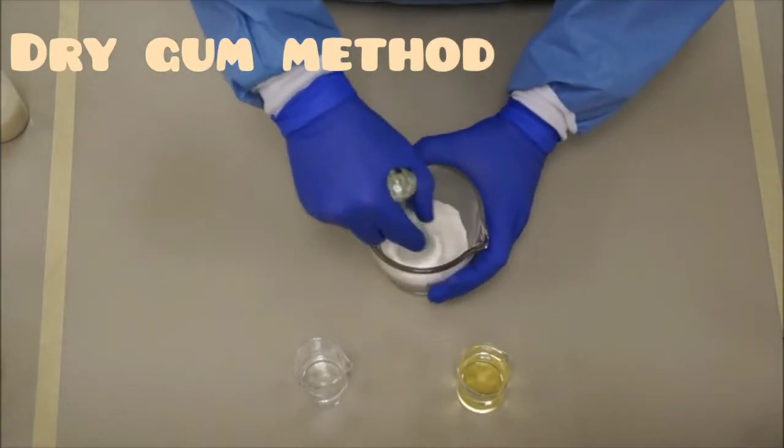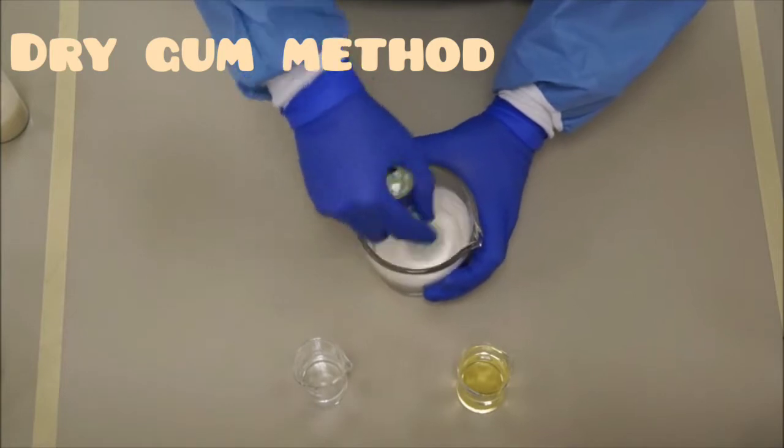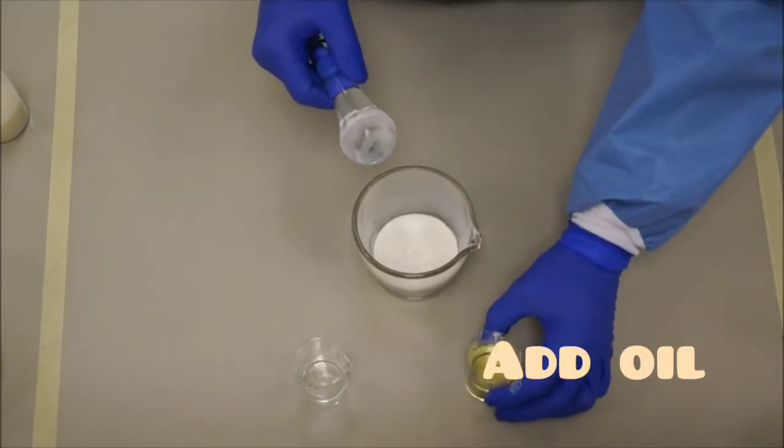Dry gum method: first take the acacia and triturate it by making concentric circles, starting in the center and applying pressure to reduce the particle size. Now you have to add oil, as it is the dry gum method, so you will add the oil first.